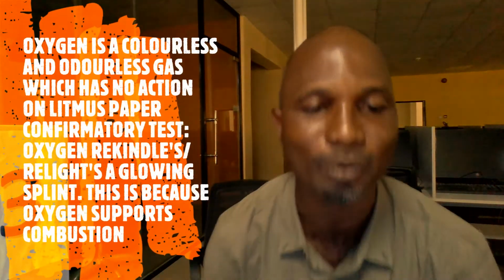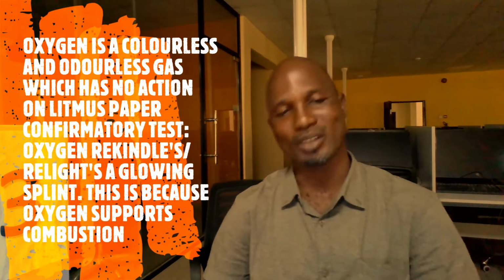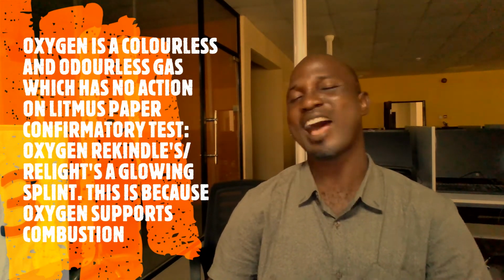Very common gas that we all talk about: we breathe in oxygen. How do you identify oxygen in the laboratory? Remember, oxygen is also a colorless gas and it's also odorless. Just like hydrogen, it has no action on litmus, meaning that it is neutral. It's neither acidic nor basic.